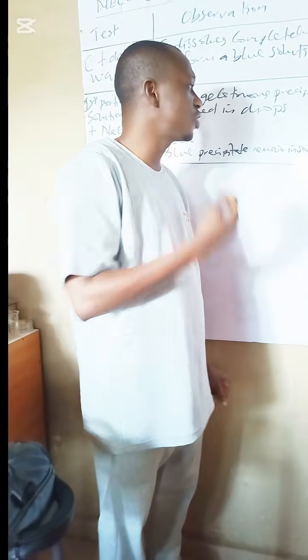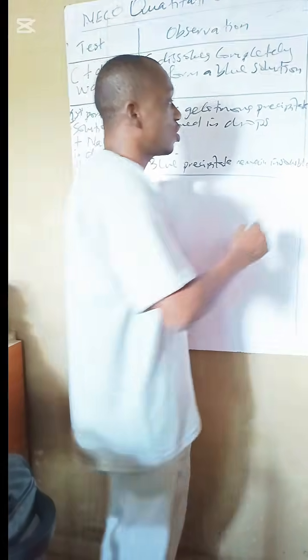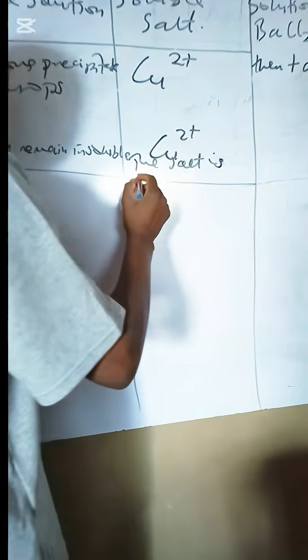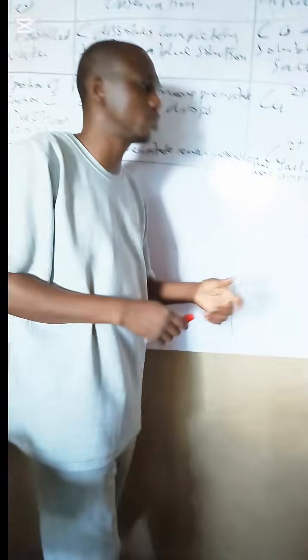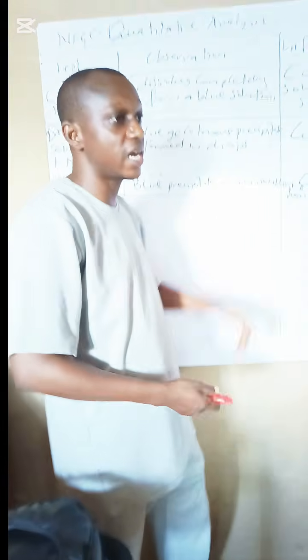Normally, if it dissolves, it means the salt is amphoteric. But now it doesn't dissolve. It means that the salt is non-amphoteric, and that's why it doesn't dissolve. Sometimes we need to say that. But the normal thing they want to know is that Cu2+, another Cu2+.